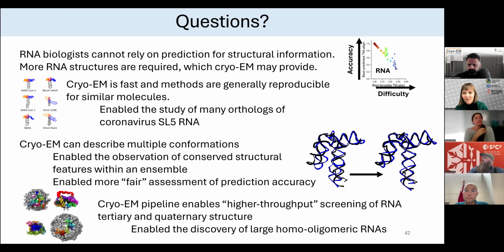So aggregation at the, I guess, carbon-water interface, I don't know what the proper name for it is, we see quite a bit. So it's not rare, let's put it that way. We especially see it with RNAs that are less structured, like the viral RNAs, for example.